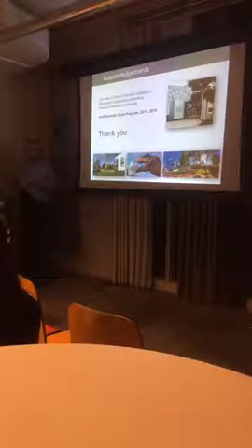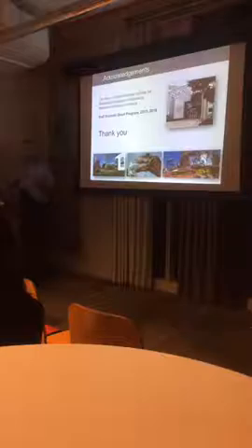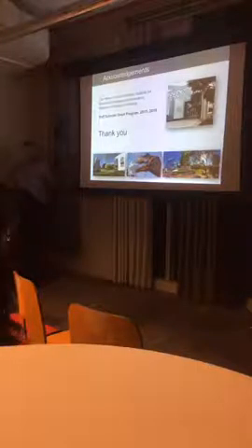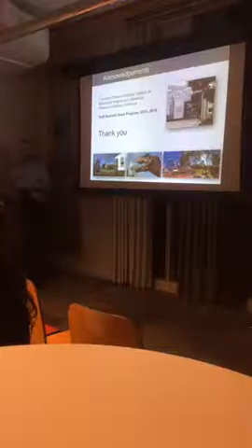It's not an ideal situation. The best would be to have 1,000 frames per second. It's much better quality, but the price for a fast camera is much more expensive. But it's good to use a fast camera.